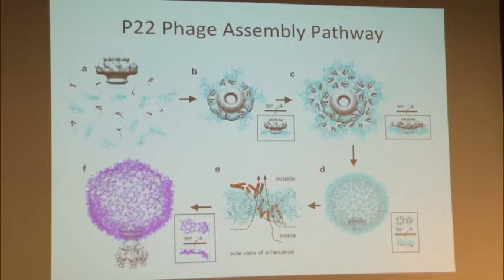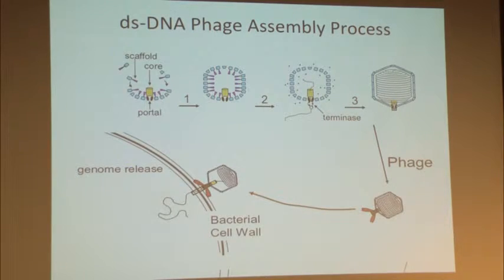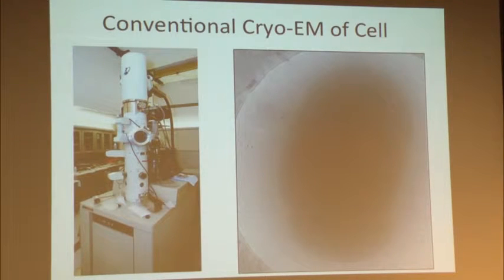We call it the reductionist approach. We look at the whole thing, we grind it through, we purify it, and we study it to high resolution. Now, to me, the next excitement in the field, in structural biology and multi-scale imaging, is looking at this kind of virus particle inside the cell. So in the next 5 minutes, I want to show you some of our study looking at the virus particle inside the cell. So here is the microscope.